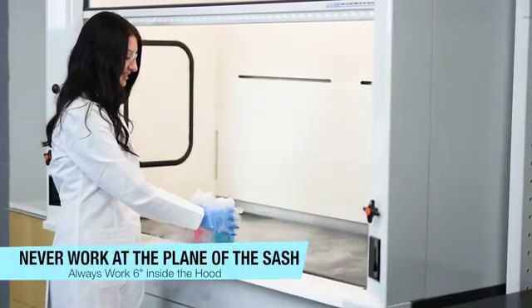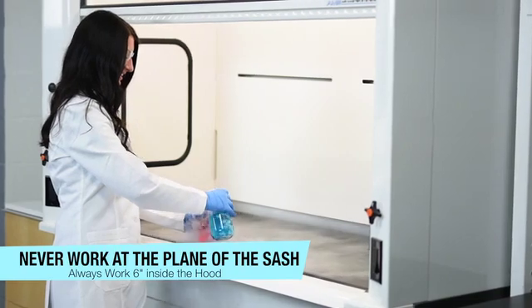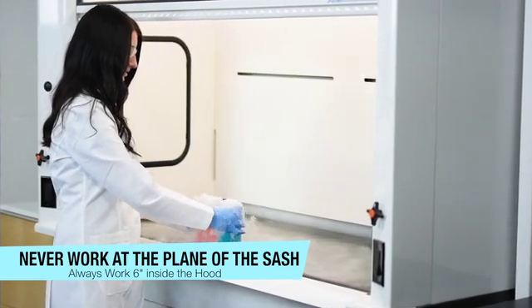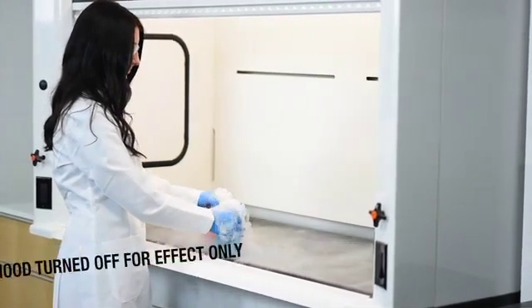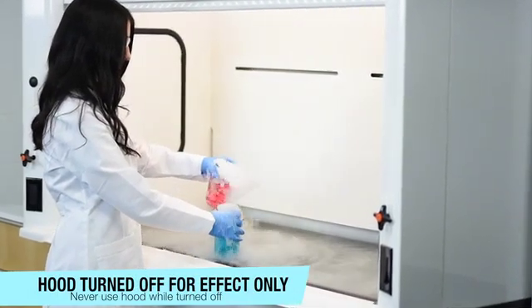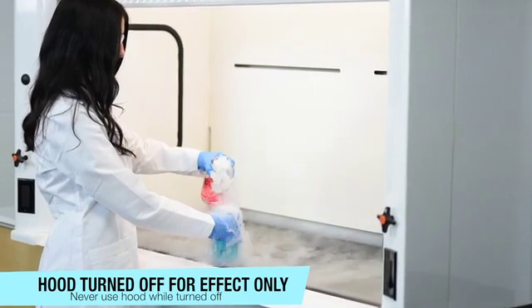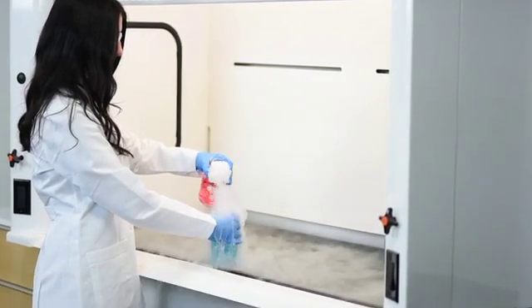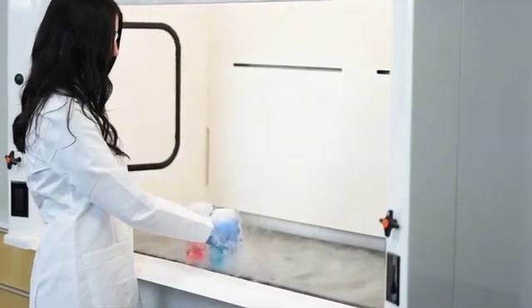Uh oh, this doesn't look good at all. The sash is entirely too high, and we are working way too close to the front of the hood. As you can see, we turned off the fume hood for dramatic effect. With the sash opened up too high, and with your experiments way too close to the front, this is a dangerous situation that should be avoided at all costs.